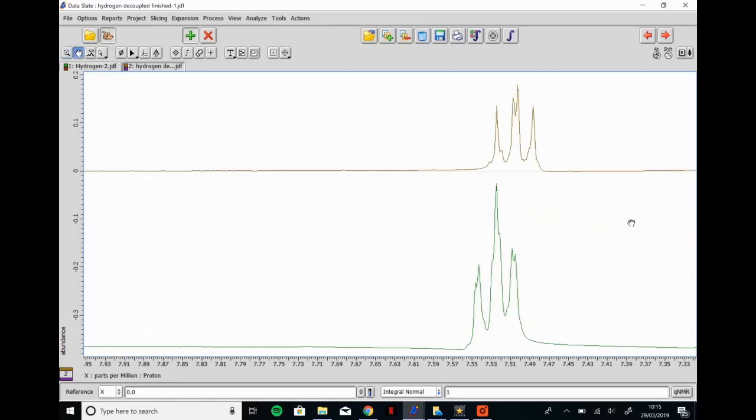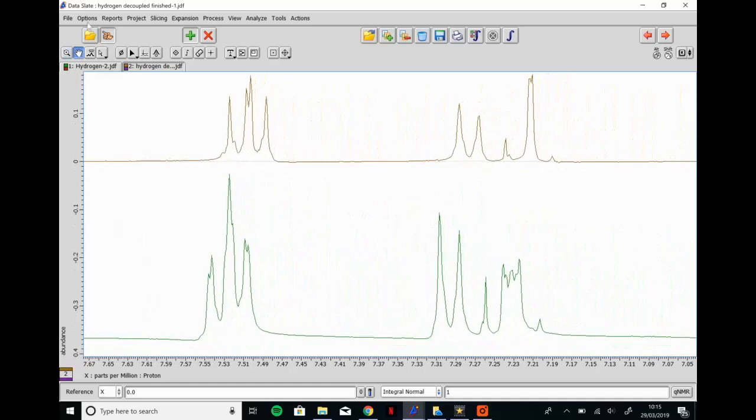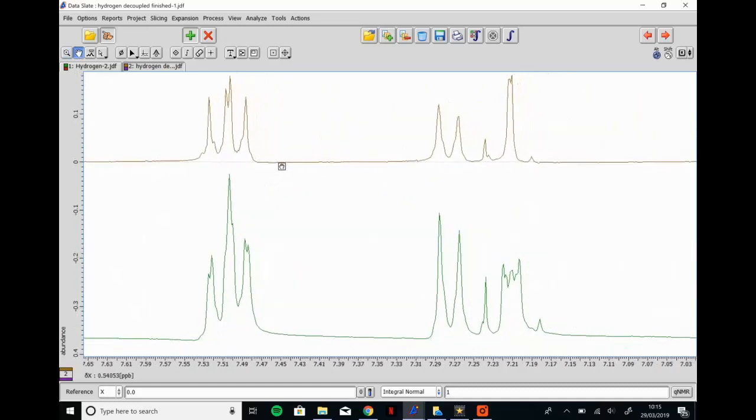As this compound is a fluorinated one, where the fluorines are attached to the benzene rings, the only change in peaks are present in the aromatic region, just as expected.